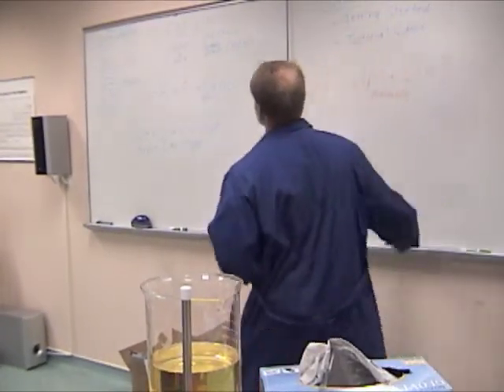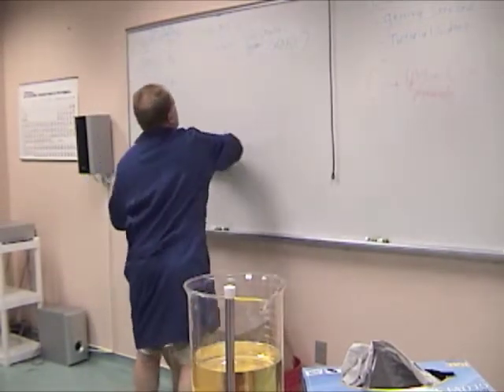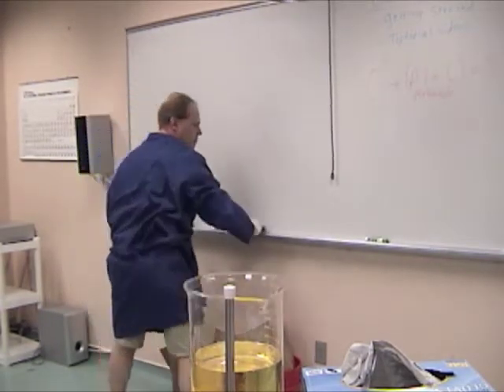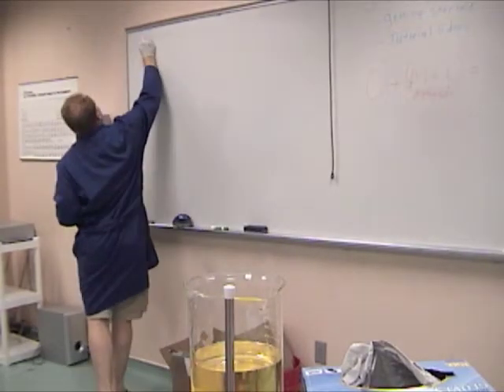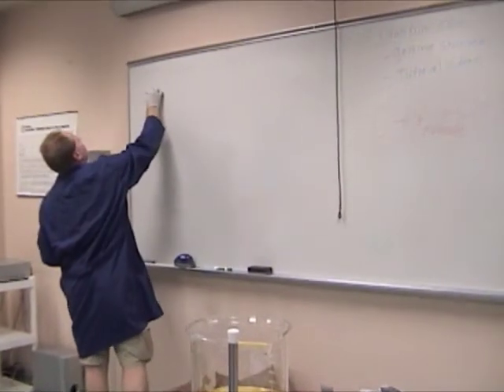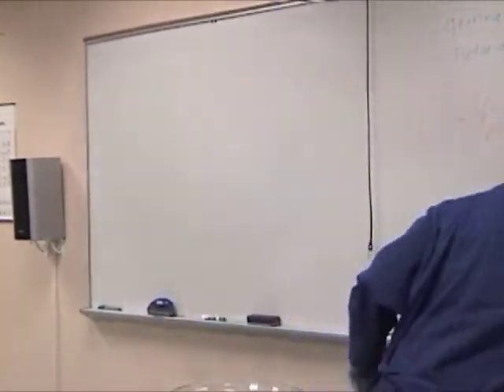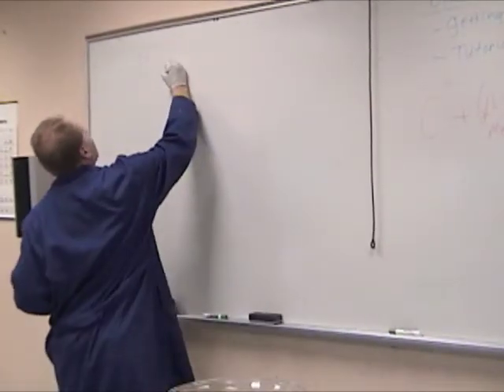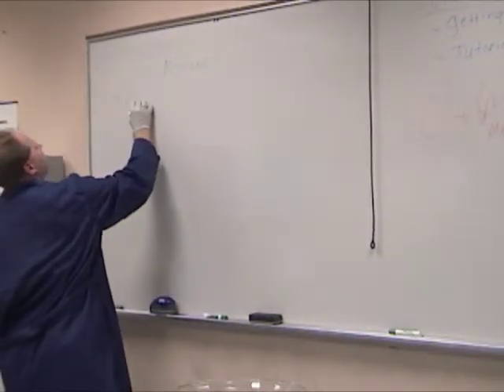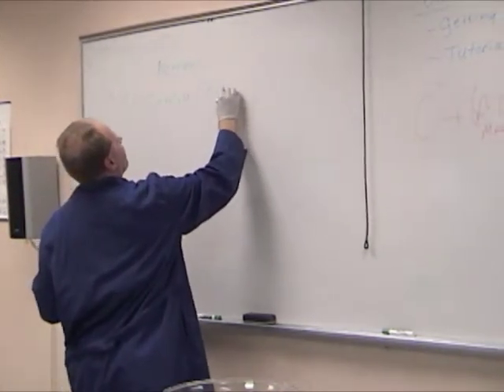Okay, let's talk about this basic recipe. Everyone kind of get the gist. We're going to erase this and do the basic recipe here. So I've got 1 liter of oil, 200 milliliters of methanol, I'm going to use 7.5 grams catalyst, and I'm going to use KOH, okay?